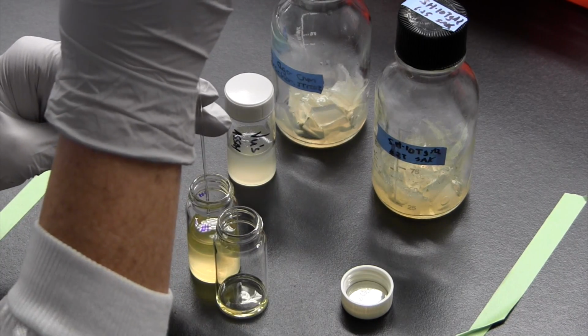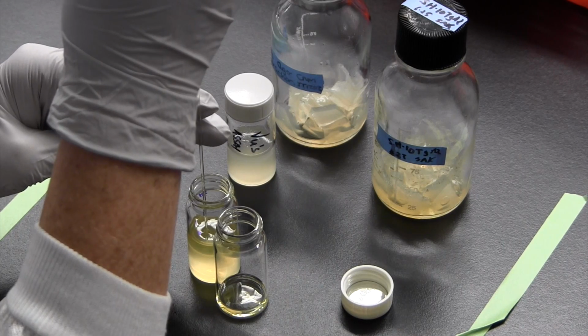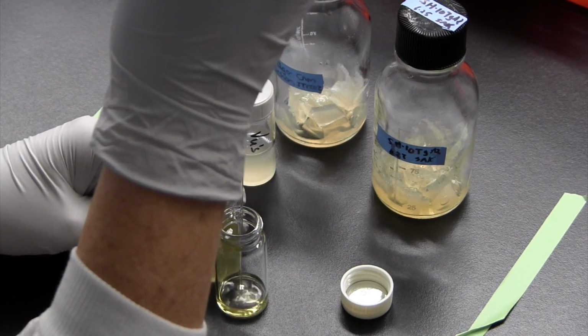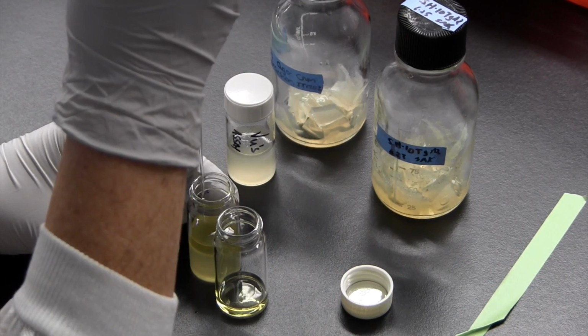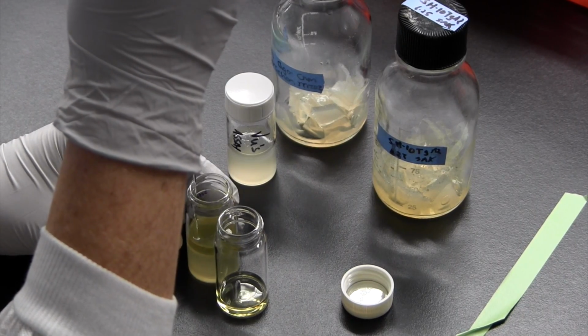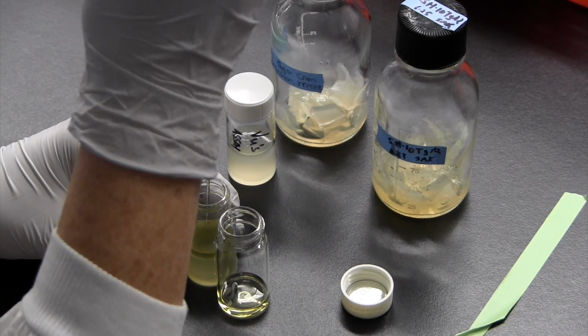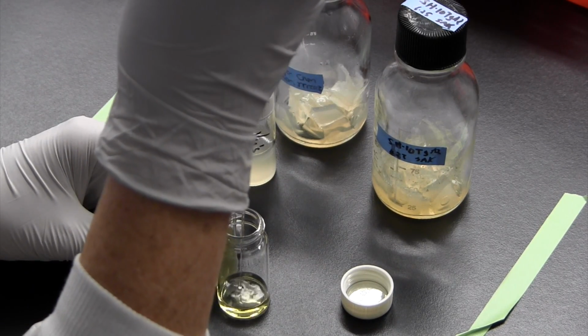And so the volumes here can also be really variable depending upon the amount of water that was in your plates when you started, the humidity in the air. So there will be some variation in terms of the volumes that your students are getting as they pull off this top layer, as well as the whole extract itself.